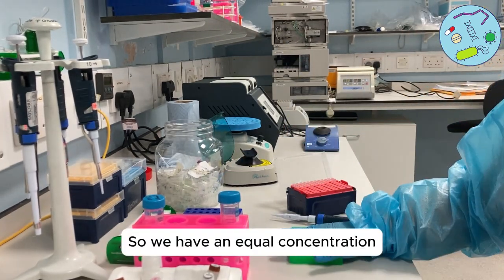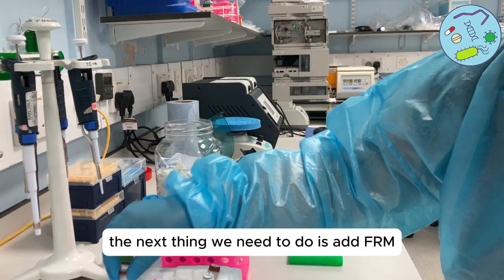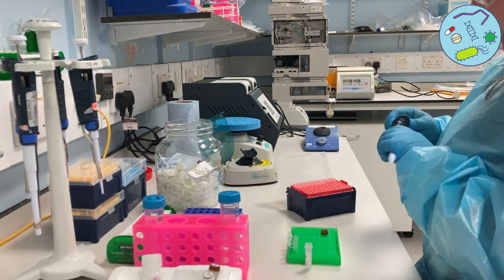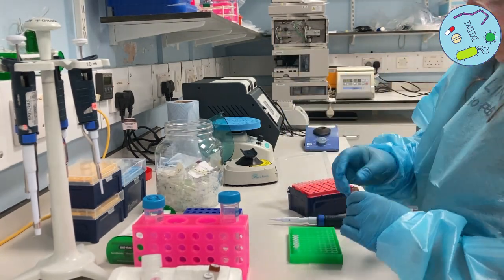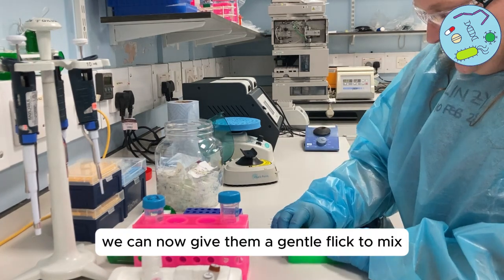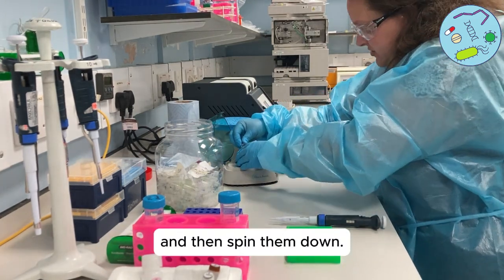So we have an equal concentration of DNA in each of our samples. The next thing we need to do is add FRM — we need to add one microlitre to all of our tubes. We've got our samples, and we can now give them a gentle flick to mix and then spin them down.